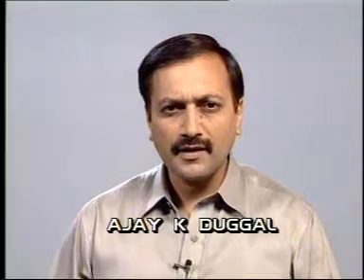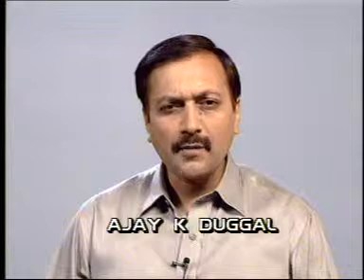Hello viewers, and welcome once again to this series on laboratory measurement in public health engineering. In our previous programs, we had seen how we measure various properties of water in the laboratory. Now, in all such cases, we need to take the water sample to the laboratory and, using an appropriate instrument like a pH meter, conductivity meter, turbidity meter, etc., we measure the concerned parameters.